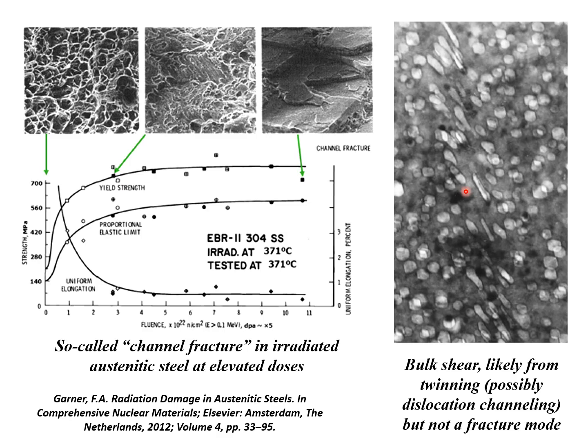You have to make a magical leap of faith to associate that, which is a bulk shearing effect, and that, which is failure at an interface. Basically, it's a planar cracking, planar failure. So I think they misinterpreted it, hadn't thought it through. And if they had thought it through, they would have realized, well, we don't know the mechanism, how it would get from here to here. And they just state it. And it's amazing how many people just buy into that. But really, it's kind of nonsense in a way.